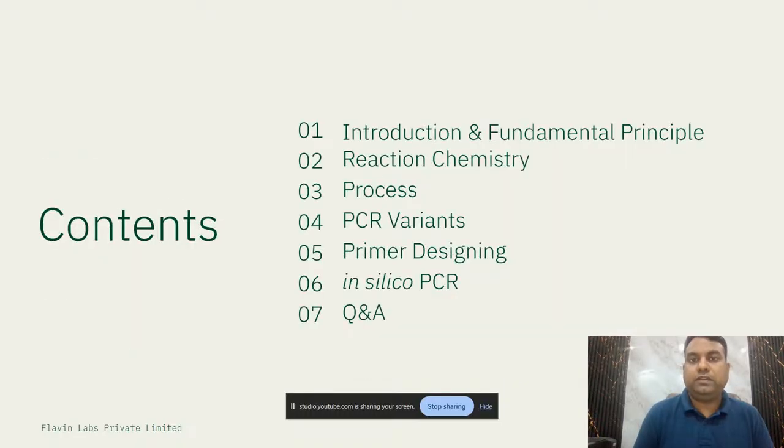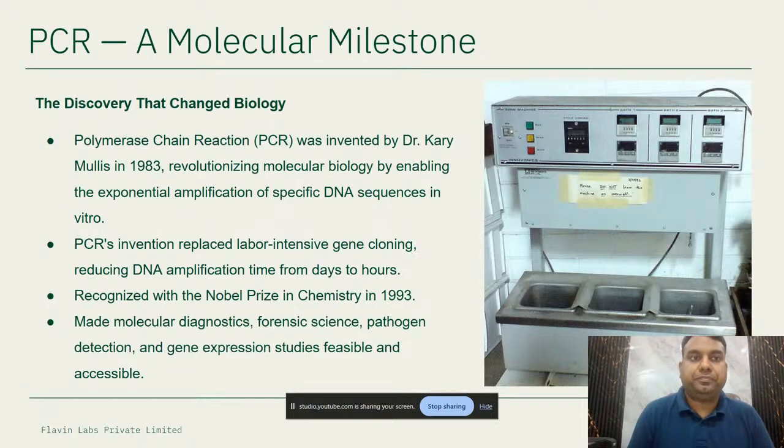In this presentation, we will be covering introduction and fundamental principles of PCR, its reaction chemistry, its process, PCR variations, how to design a primer that works, and how to validate it in silico, because in silico validation is a very important step because it saves us cost and time.